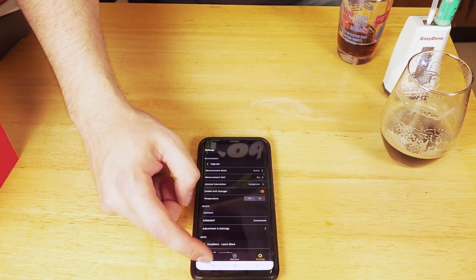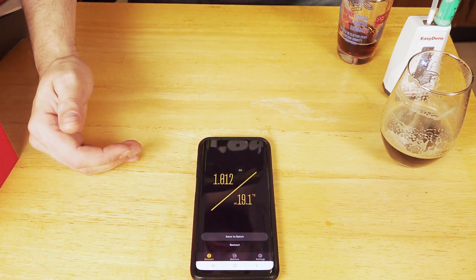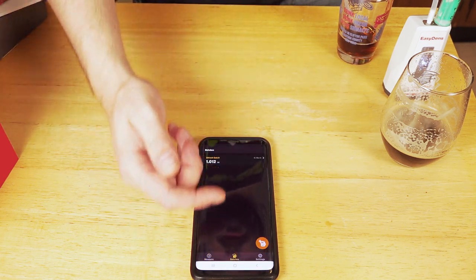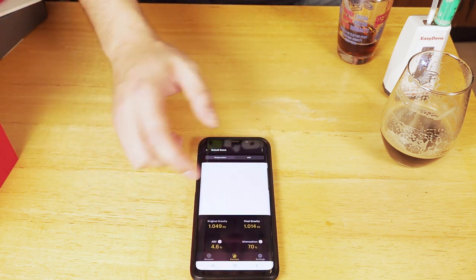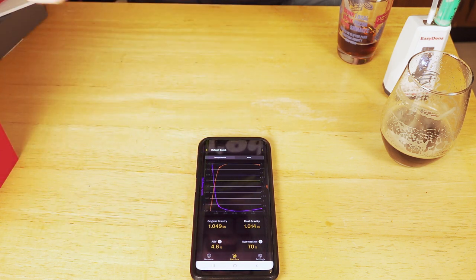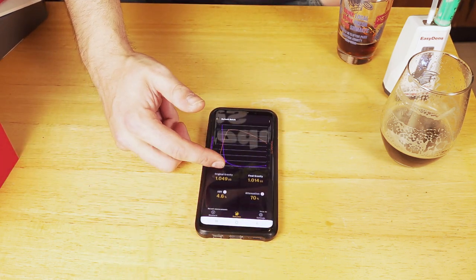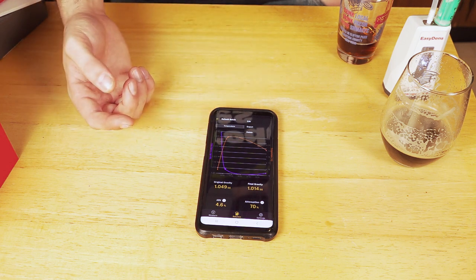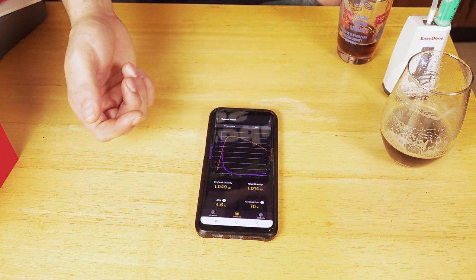I really want to talk about the app a little bit here — it's pretty cool what you can do with it. First of all, you can track individual batches. If you want to take a pre-boil, an original gravity, a mid-fermentation, or a post-fermentation gravity, you can keep track of all that stuff here. You can also add individual beers, add notes on them, and keep track via dates. It also gives you a chart where you can see the progress of things like ABV and specific gravity, just how those things relate to one another — giving you an idea of your attenuation and all these really cool features. You can also save these files and export them later if you want to use them in a different program, or just email them to yourself.